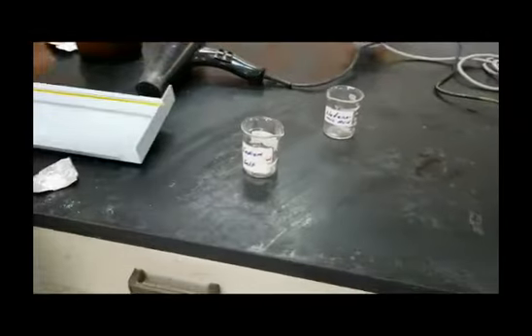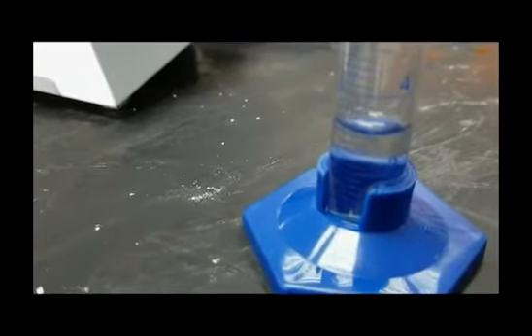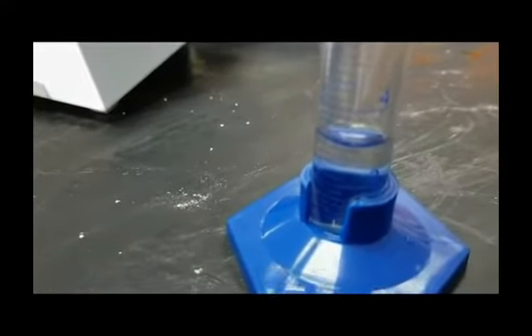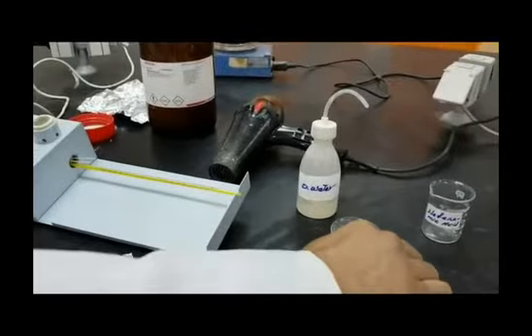Use a measuring cylinder to measure 3 ml of distilled water and add this volume to the 300 milligrams of sodium mefenamate.